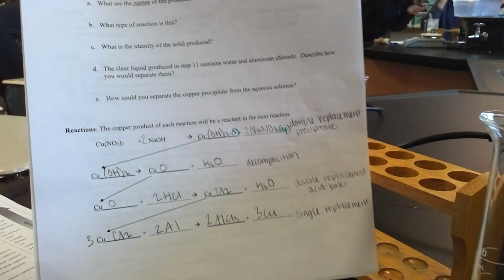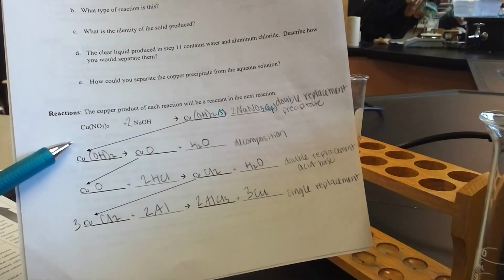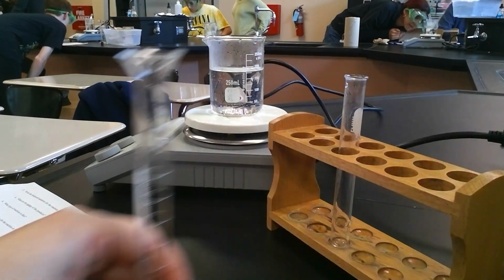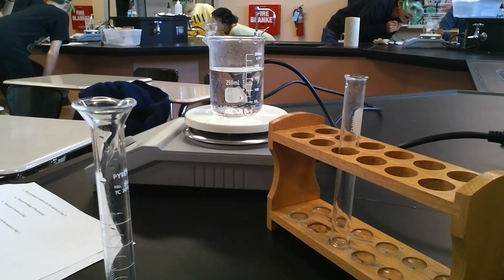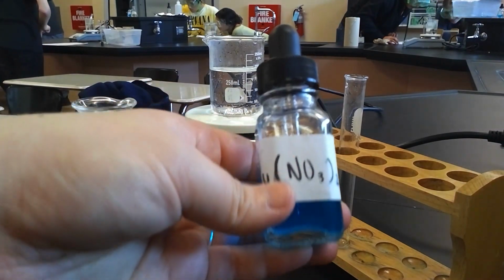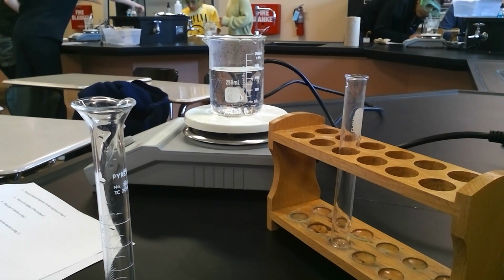Both of these will still be present in the test tube when the next reaction is taking place, but the only reaction that we're concerned about is the one that includes the copper product. That's why we took this and did the decomposition of copper 2 hydroxide. Starting with the chemicals that we needed, I'm going to start by measuring out some copper 2 nitrate. So I have this solution, Cu(NO3)2, and we need just 1 milliliter.